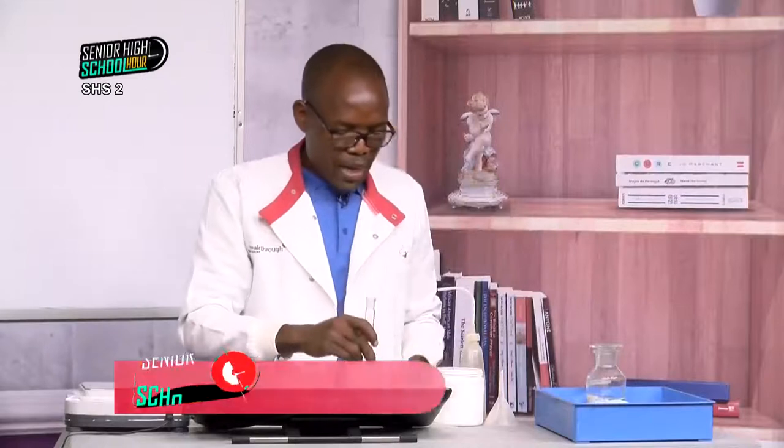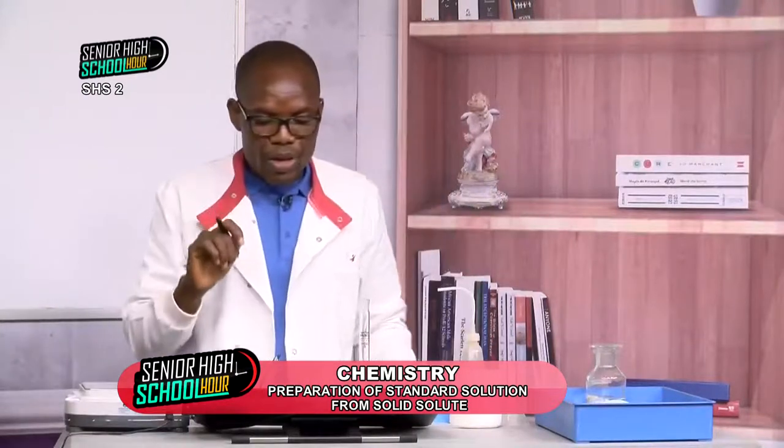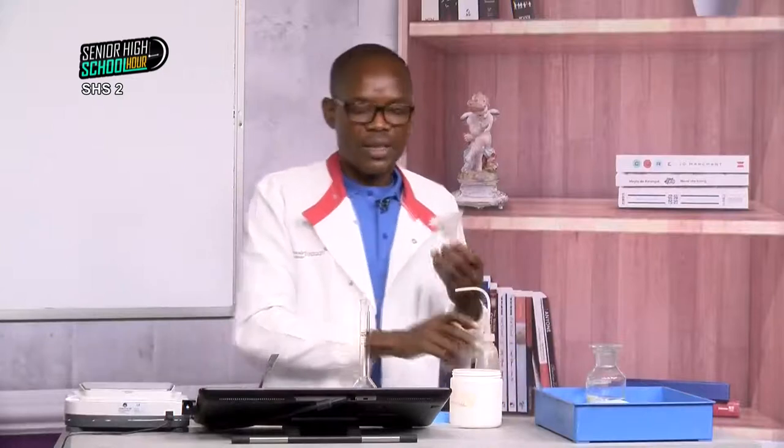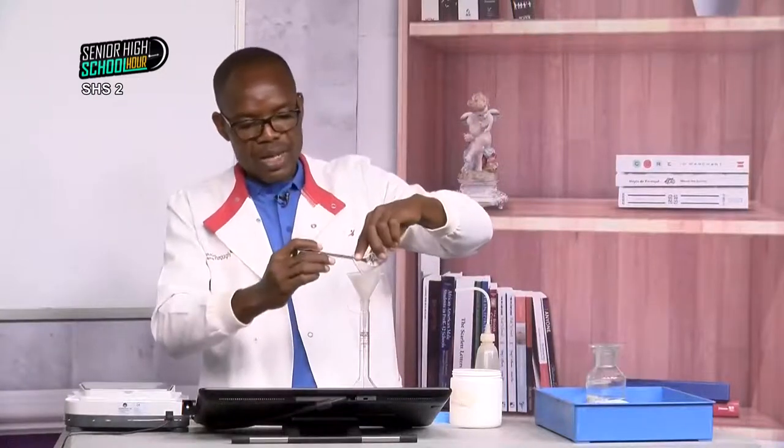Okay, so ready to transfer, please. In the process of transfer, lose nothing. Otherwise, the concentration will be less than expected or than what you have been asked to do. So we refer to it as quantitative transfer. It means you are transferring everything within experimental errors. So I want to transfer here. Lose nothing.